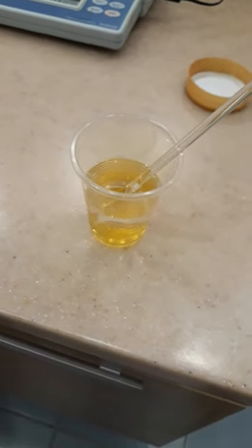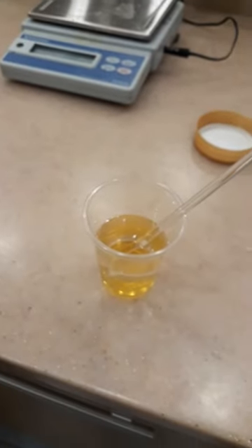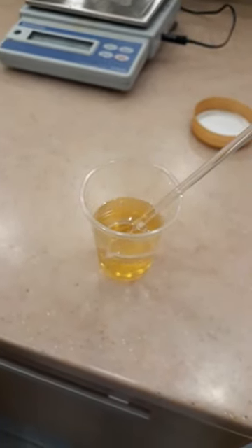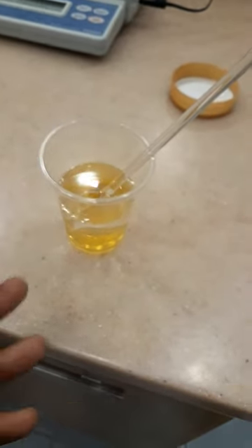Good morning everyone, hope you are well. Today I will show you how to determine the pH in honey. First of all, you need to weigh the honey — 10 grams. I already have 10 grams of honey here in the sample.